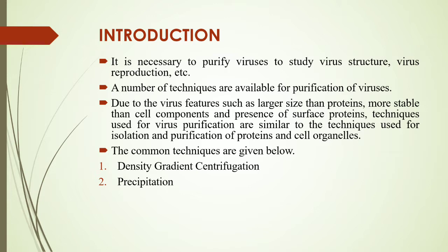Due to the virus features such as larger size than proteins, more stable than cell components and presence of surface proteins, techniques used for virus purification are similar to the techniques used for isolation and purification of proteins and cell organelles. The common techniques are density gradient centrifugation and precipitation.